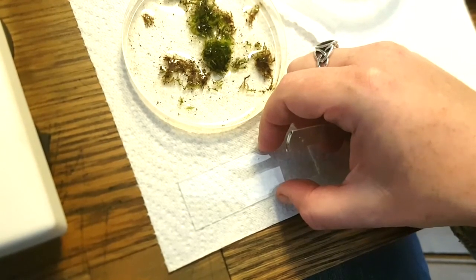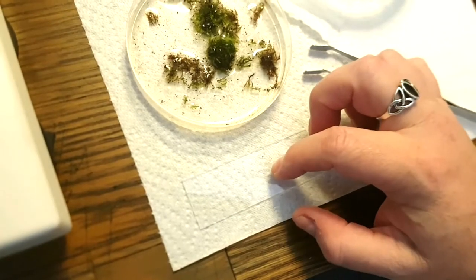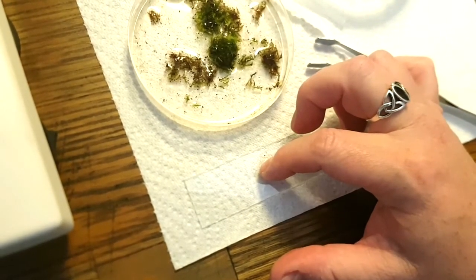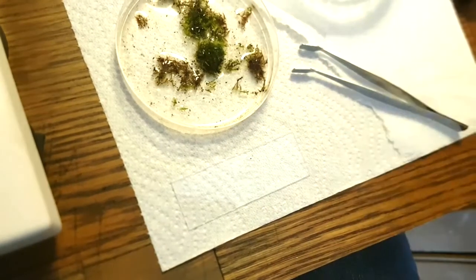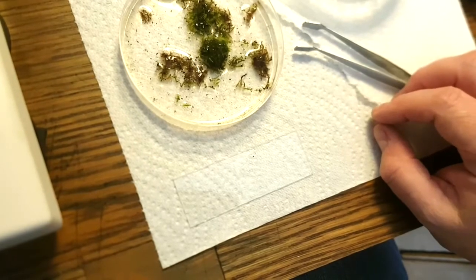Because if you put moss on the microscope slide, you can't see half of what's going on, to be honest. You just have solid lumps of green when you magnify it, and then you can't see anything other than moss, and occasionally something will peep out.